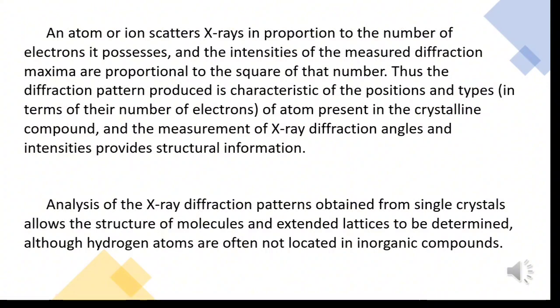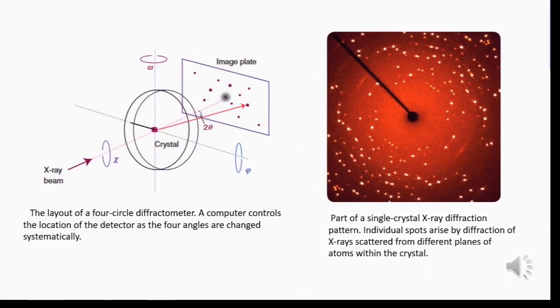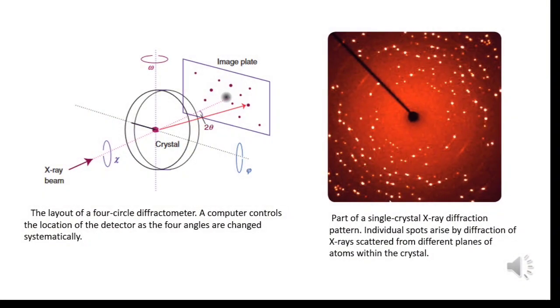Analysis of the X-ray diffraction patterns obtained from single crystals allows the structure of molecules and extended lattices to be determined, although hydrogen atoms are often not located in inorganic compounds. There are two pictures. The first one shows the layout of a four-circle diffractometer, and the second a part of a single crystal X-ray diffraction pattern.